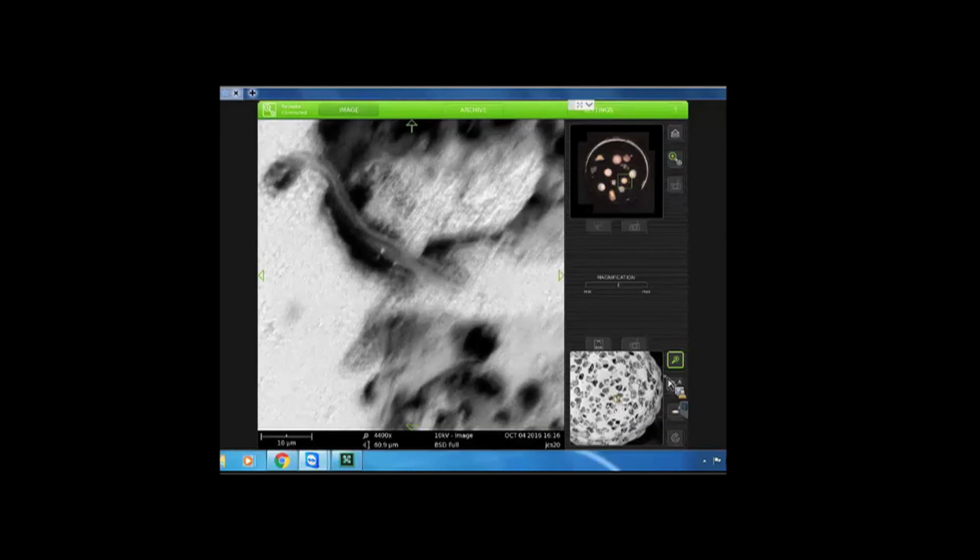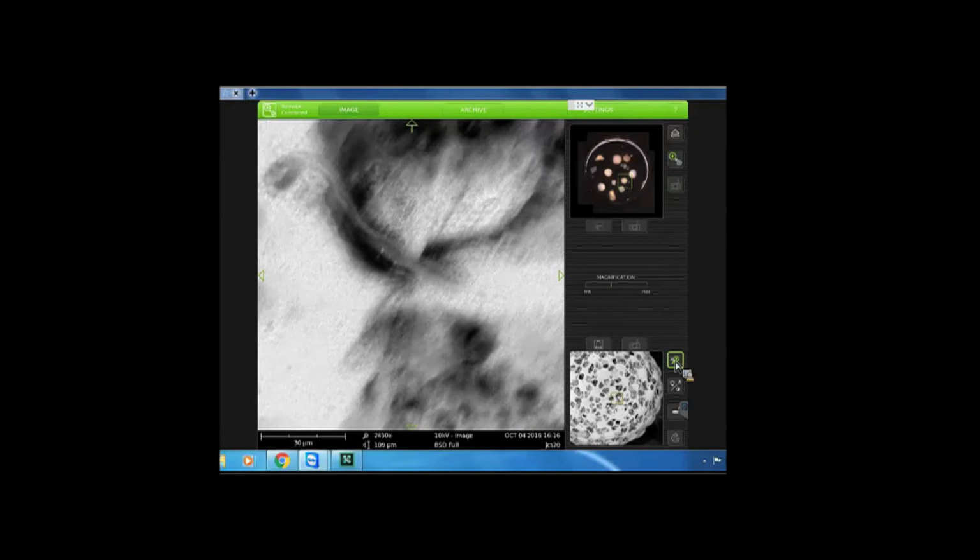Let me back up a little bit. Let's go back to like 30 because I have a question for you. Once I get back there, let's see. Move it over to the magnifier. Now, click roll. I got a roller. Okay. Remember, don't roll it up. I know you're rolling it up right now. Remember, that's magnification. Roll it down. Oh yeah, to magnify. Okay. Sorry. There we go.